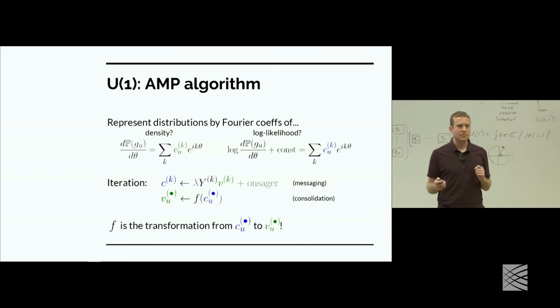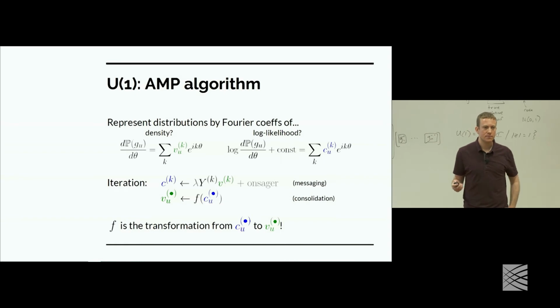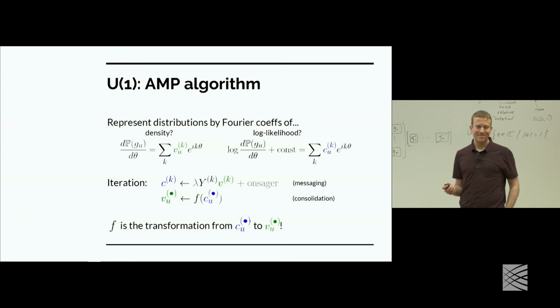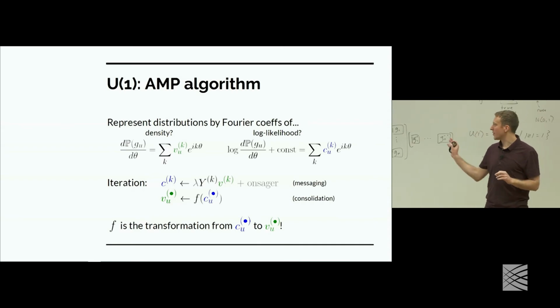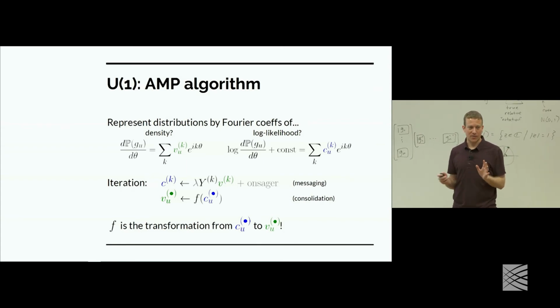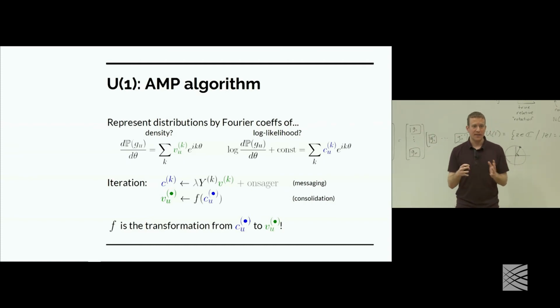Yeah? So for this, you're assuming that for each of the different frequency channels, the noise is independent even between them. Is that reasonable if you're looking at cryo-EM? Right. Yep, that's another good question. Definitely there are a lot of various issues here about how much this model matches the true cryo-EM in terms of dependencies among the noise and things like that. I will get to a slide later where I talk a bit about this. But definitely this issue is probably the biggest weakness of this method in terms of running it on real data that does not come exactly from these types of models.